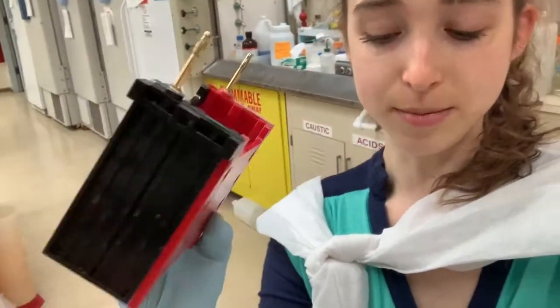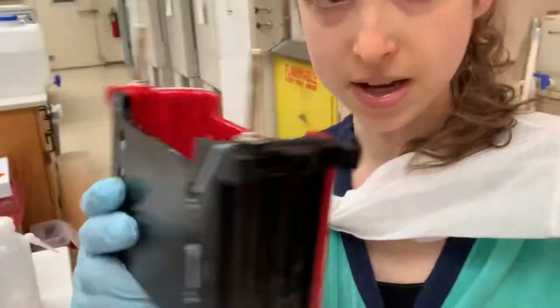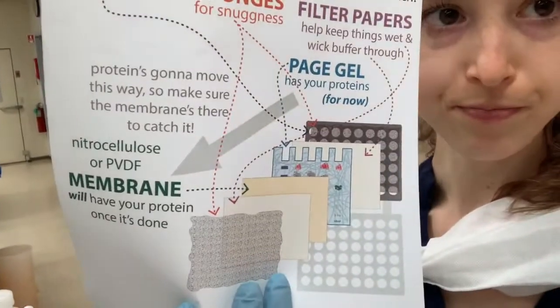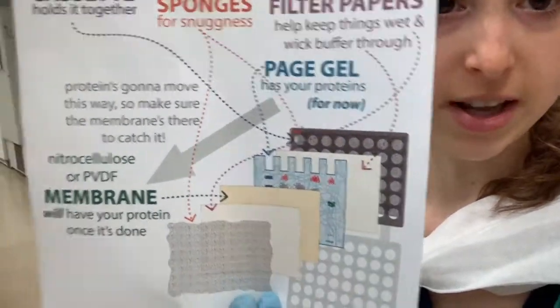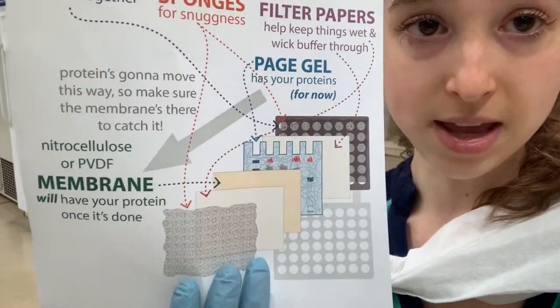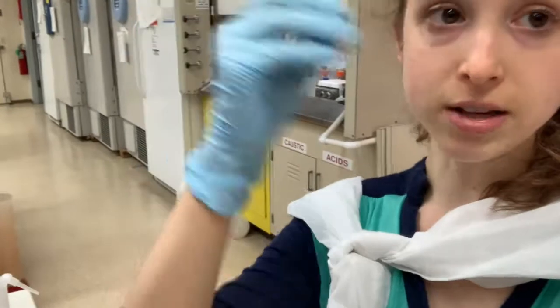To do this, we're going to use a semi-dry transfer system. It fits into the same box used to run the gel, but it's different, and it's going to move things horizontally. With SDS-PAGE, we went vertical — down — and now we're going to take it out of the gel and onto the membrane. We need to set up a transfer sandwich. It has sponges to keep things snug so nothing shifts around, filter papers to wick the liquid and proteins through, and then the membrane. You run the electricity and it takes the proteins out of the gel and onto the membrane.